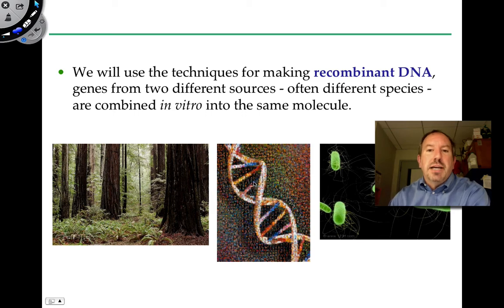Well, first off, the ability to combine one organism's DNA with another is called recombinant DNA. The reason that we're doing that is bacteria are famous for growing very quickly. And so we could put DNA into the bacteria and let the DNA grow and grow and grow, replicate more plant DNA and clone. And then when we have a lot of DNA, we can break the bacteria open, pull the redwood DNA out, and sequence it.